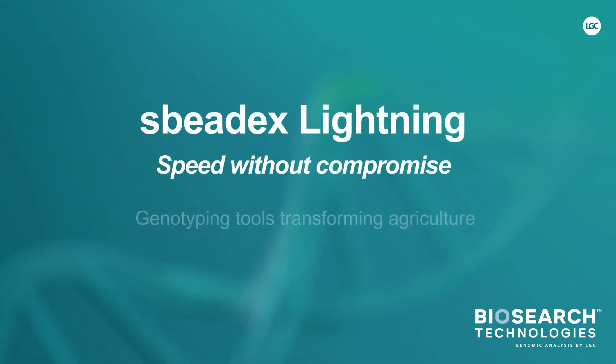sbeadex Lightning — speed without compromise. Biosearch Technologies.